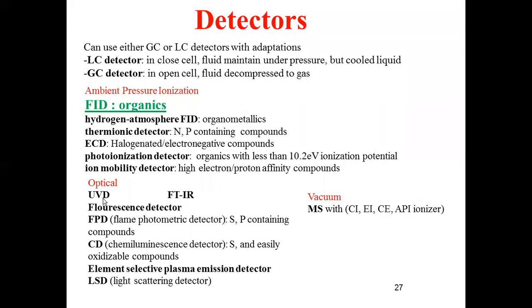You know the principle of UV absorption detectors. The detector will be set at a wavelength of 250 or 254 nanometer or 260 nanometer or 330 nanometer or 365 nanometer, whatever it is. At that particular wavelength, the relative absorption or the transmission is going to be measured. And the stretching frequency is going to be measured while using an IR spectrometer.